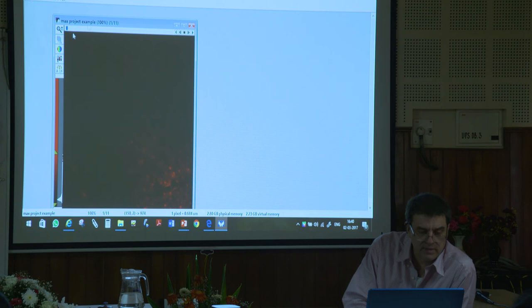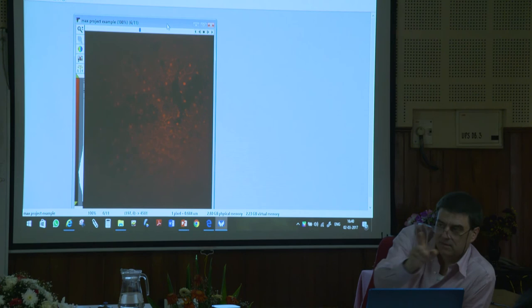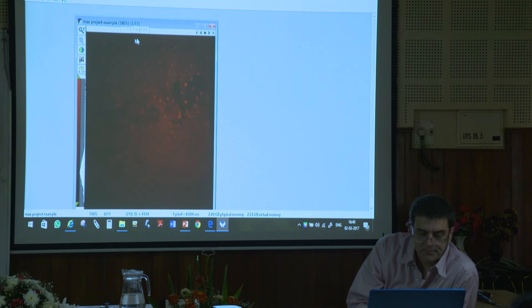Okay, remember what we talked about yesterday with the confocal? Here's another stack. This is similar to what somebody showed me yesterday. I can't remember who it was, but somebody showed me something. It was you, right? Okay, that's right. So this is actually retina.